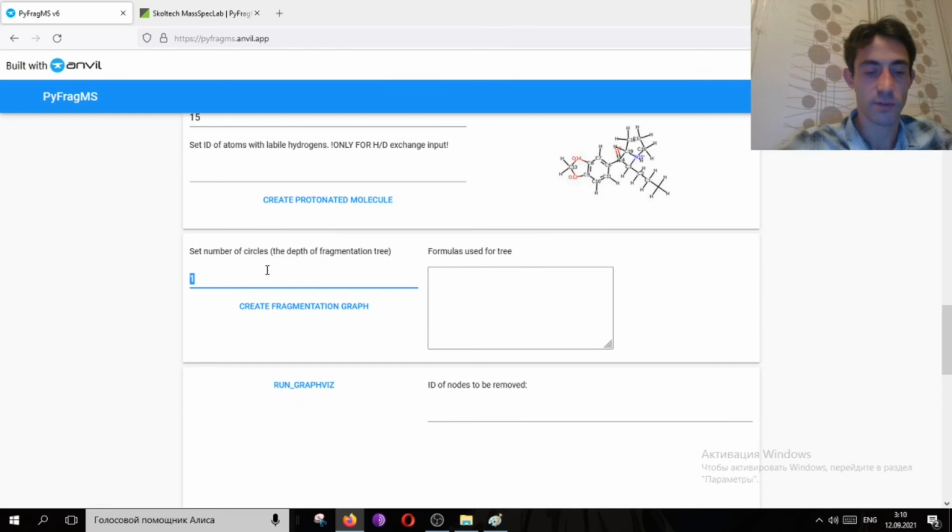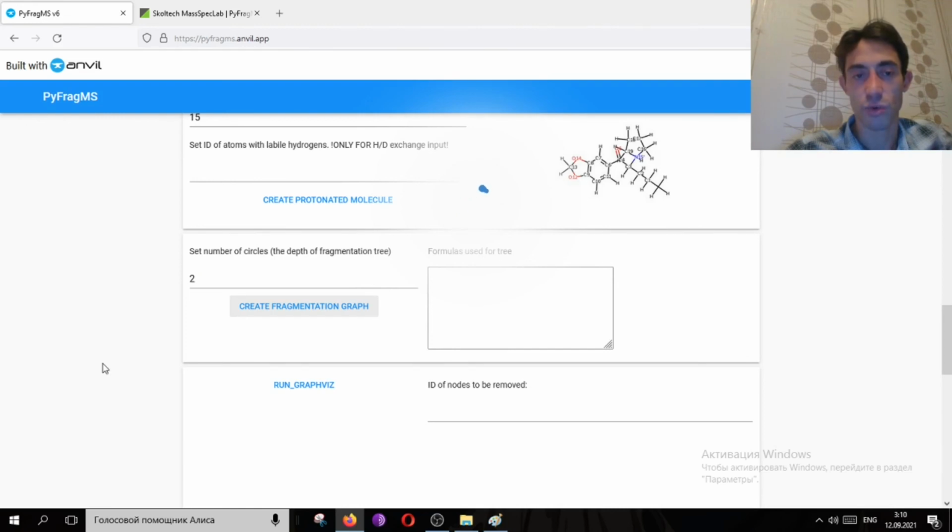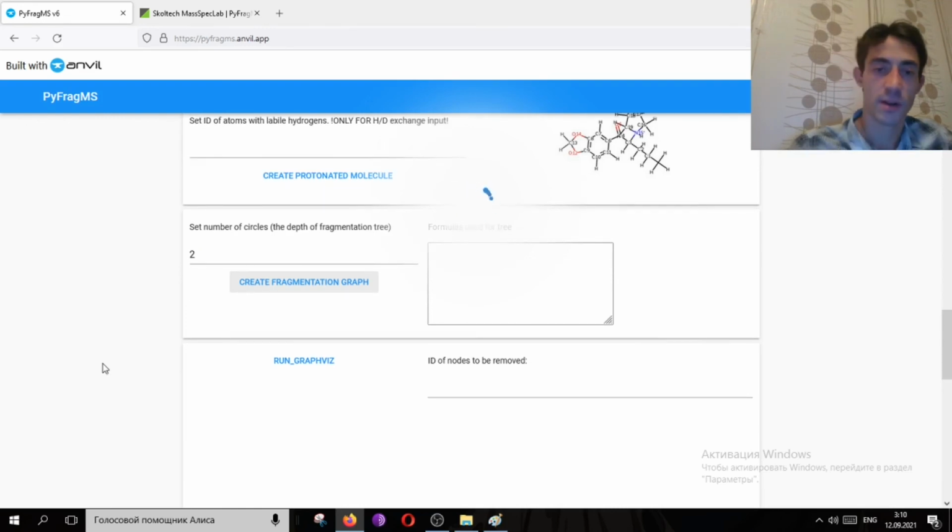For example, for 2 cycles, the calculation will take more time, maybe several minutes. So let's wait and see what we will get.